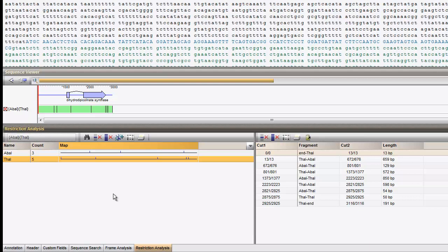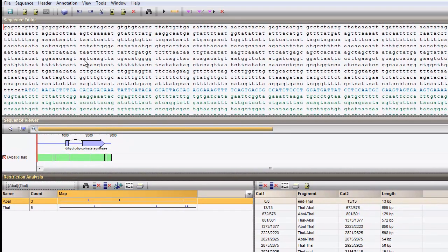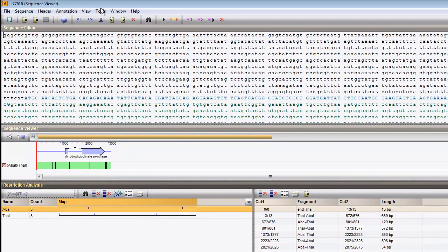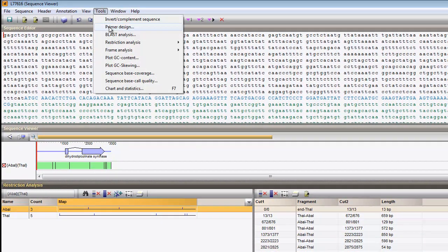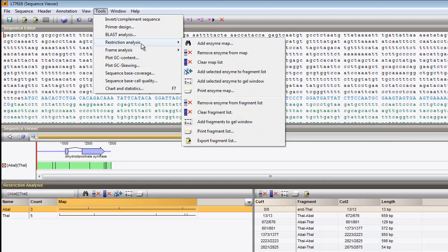With this information, a virtual gel can be created. Select AbaI and choose Tools, Restriction Analysis, Add selected enzyme to gel window.